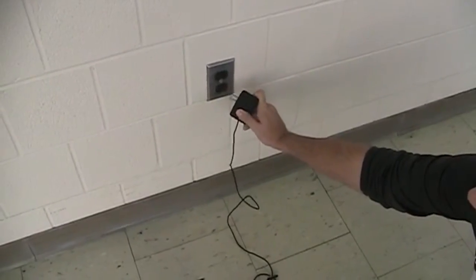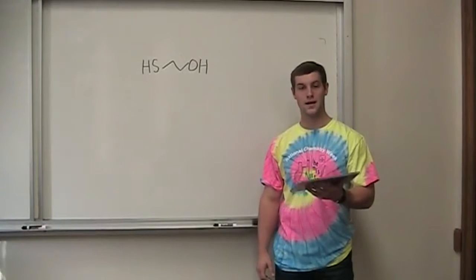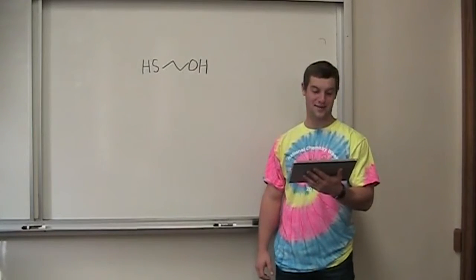Next, we apply a charge to the, it's not the well, it's to the gel. Do whatever for the disulfide bonds. And Jake's recording now because he wants bloopers. Oh, and he, beta-mercaptoethanol, or BME.